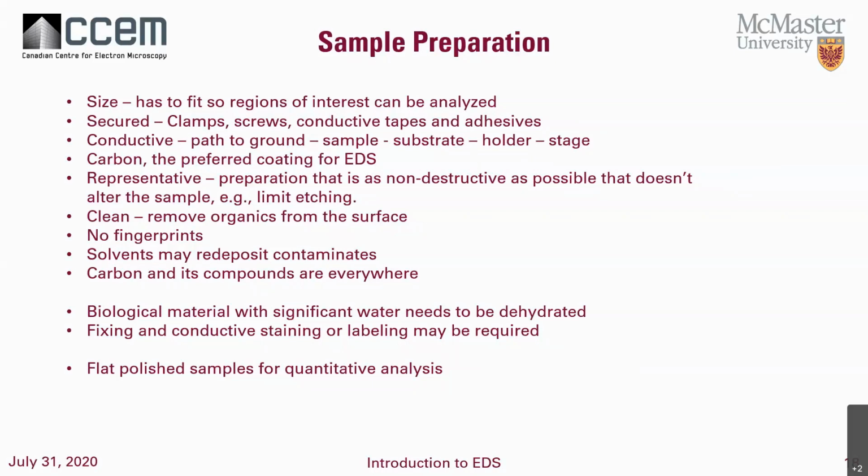Acetone has a tendency to redeposit some things, so sometimes you're better to use a higher quality solvent for cleaning things. Carbon, unfortunately, pretty well everything on the planet will have carbon on it.